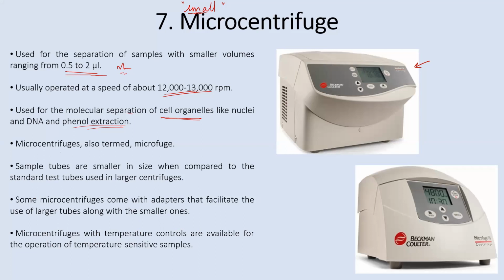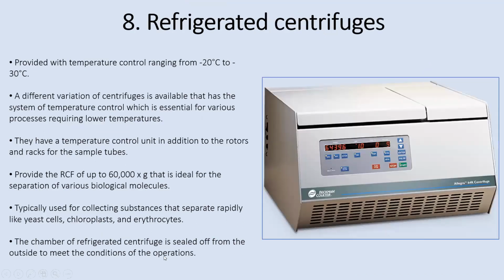I would say it requires the temperature factor. It's very important that the temperature factor is there in molecular biology experiments. Otherwise, the DNA would degrade if you just leave it like that, or some experiments may not work. So temperature is important there. Again, as I said, if you're going to centrifuge at such a high speed, then because of the generation of heat, the biomolecules may degrade inside. They are very sensitive to that change.